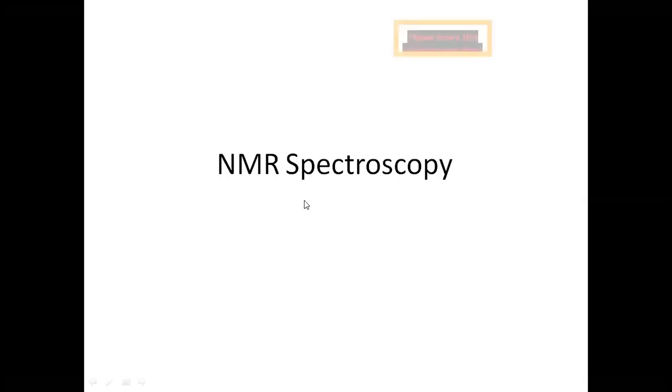We have to discuss the problems based on spectroscopy today. How you have to solve the problems based on spectroscopy, that we have to discuss.